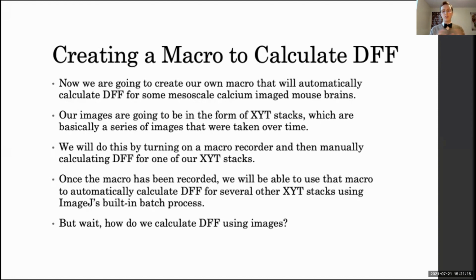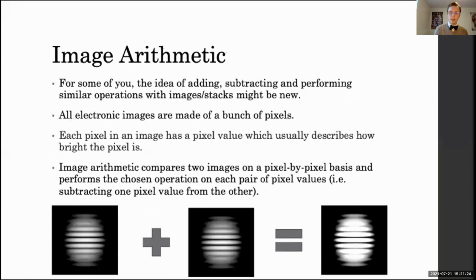Now, all of that sounds well and good, but first we need to figure out how we actually calculate DFF for images. And we are going to be calculating the DFF for our images using image arithmetic. I imagine that some of you have heard of image arithmetic before, but for many of you, the idea of adding and subtracting and performing basic operations on images or stacks might be new and it might seem kind of strange.